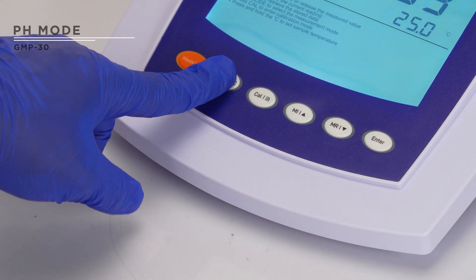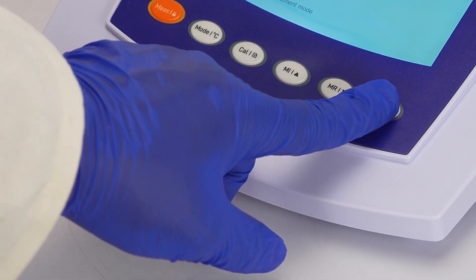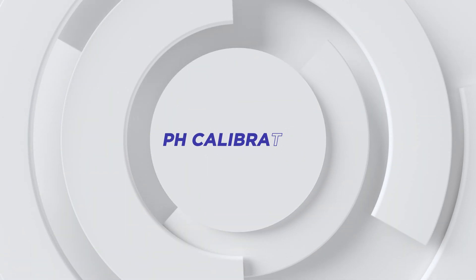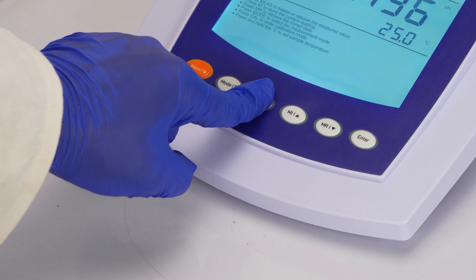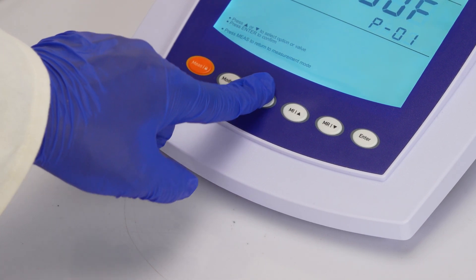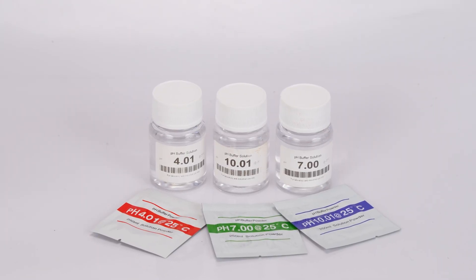To switch to pH mode, use the mode option. Once selected, press enter to save your changes. Long press the cal key to adjust settings such as the pH buffer group and calibration point. Press the cal key to start calibration with three standard buffer solutions.